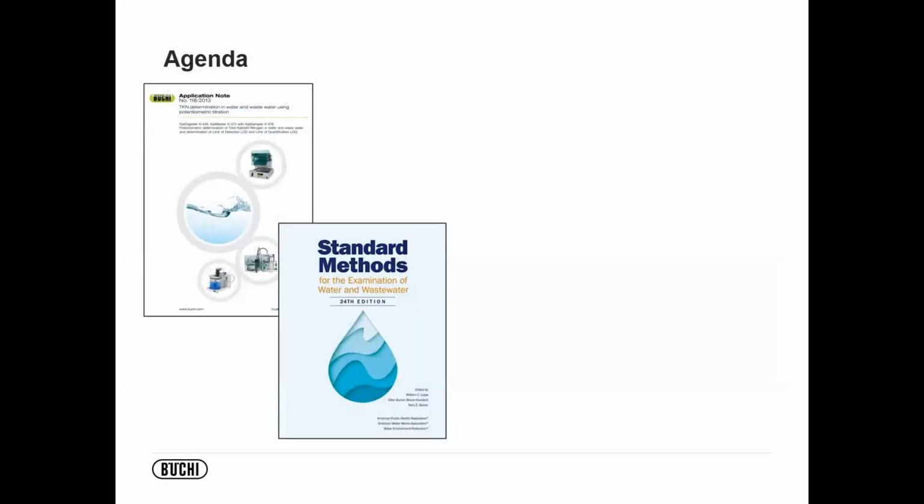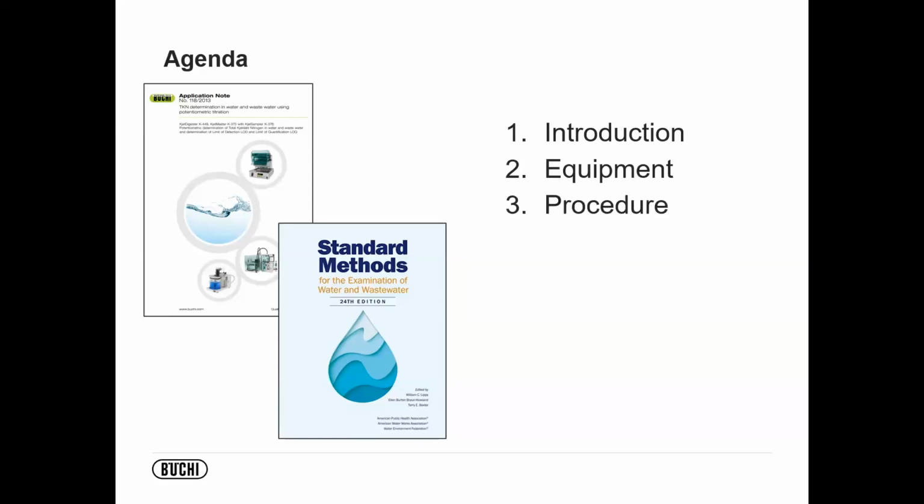So the agenda today, again, we're covering TKN determination based off the compliance needed to run this here in the United States. We're going to do a brief introduction into what we're going to discuss, the equipment used in this particular workflow, which is automated TKN analysis in wastewater, and the procedure.